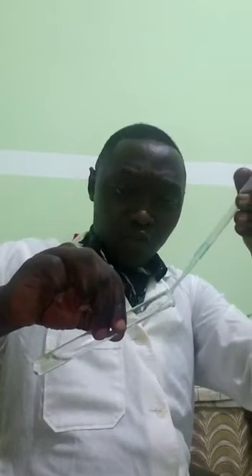In the Biuret test, first, you collect 2 milliliters of food sample X and you place it in a test tube. So collect 2 milliliters of food sample X, place in a test tube. You collect 1 milliliter of sodium hydroxide solution and you place it in. Now, very important in this test, you slant or tilt the test tube and you put 10 drops of copper sulfate down the side of the test tube to the solution.